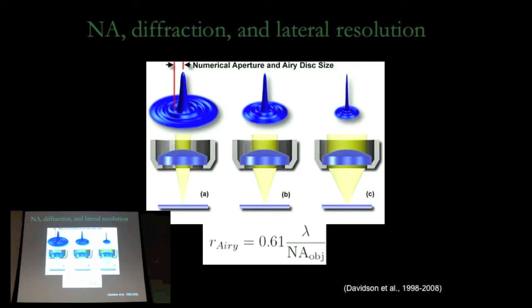I thought, in my mind, it's more related to the distance of the lens to your specimen. Here it's the same distance. Yeah, right. As you go up in numerical aperture, the working distance gets shorter and shorter. You're going to be closer to the objective. So this is not to scale. Right. Okay, so that's sort of another trade-off.